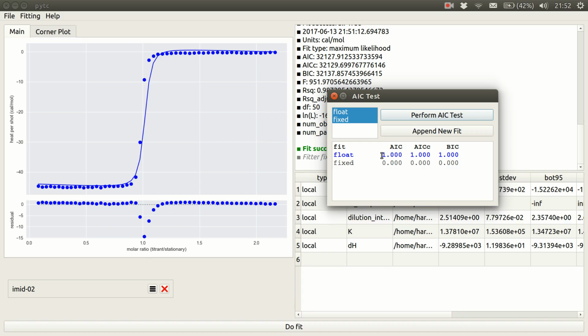And these values basically all strongly support float. All of the probability of minimizing the information loss is set on the float for all 3 of these tests. And so we would find this strong evidence that we should include a floating fraction competent parameter. So you can imagine doing this for any number of different parameters that you want to estimate, but using this flexible framework, you should be able to do it as you need.